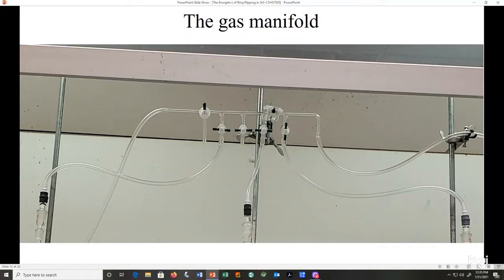Then we have the gas manifold. You can see this line coming in is supplying our nitrogen gas, and if we were doing this in person, we'd be doing 3 separate reactions, so we would have this valve and this valve open. But since we're just going to be looking at one reaction, this is going to be the only valve that's open. And then there's an exit place for the nitrogen gas, and that's going to go to our nitrogen bubbler.